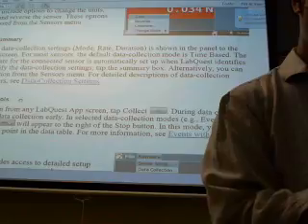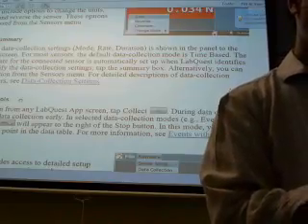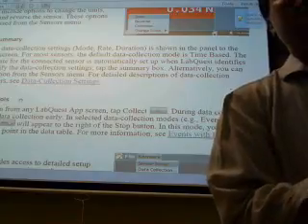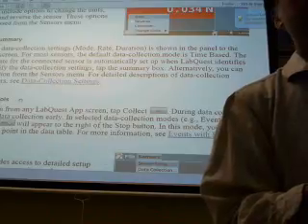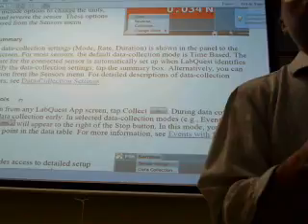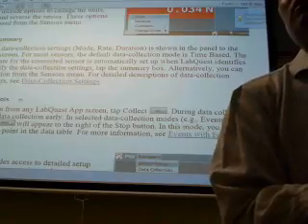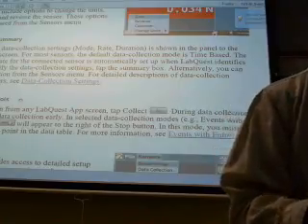All right, then we could take a look at the data here. If you hit the little data table, the XY data table, you can see the data points. We could transfer the data to a computer or to your phone, but we aren't going to do that. Since we're only collecting 15 data points per probe, that's 30 temperatures, we're going to write them in by hand. So you're going to copy them from the table into your notebook. How do we access the table once we save it? You hit the XY button at the top.